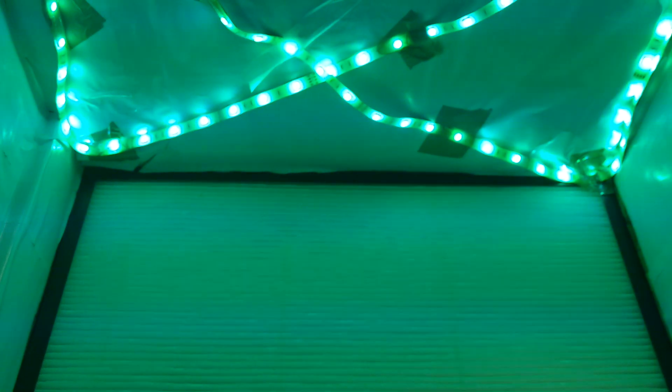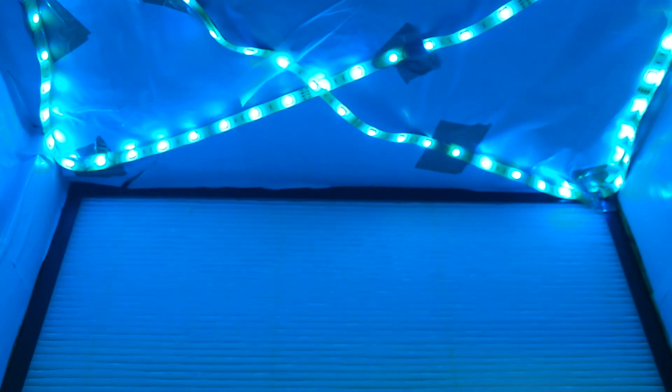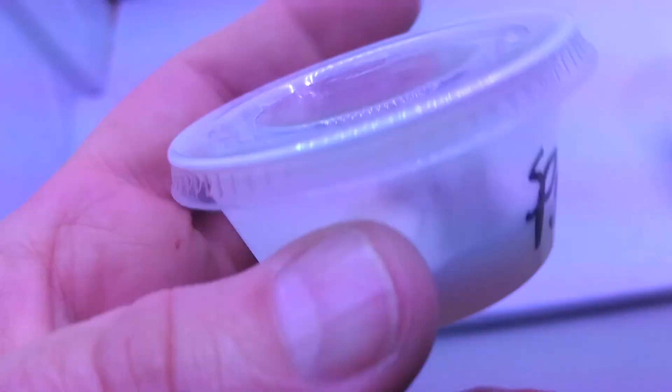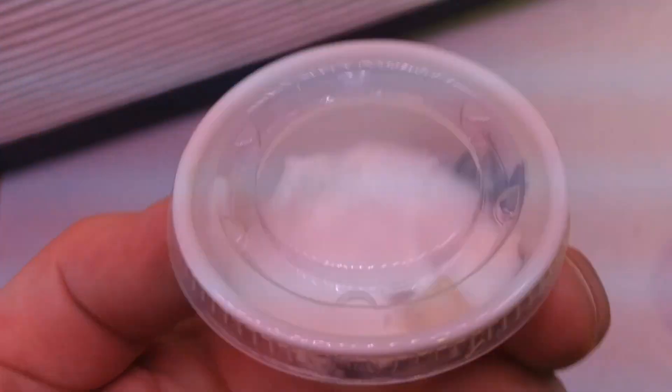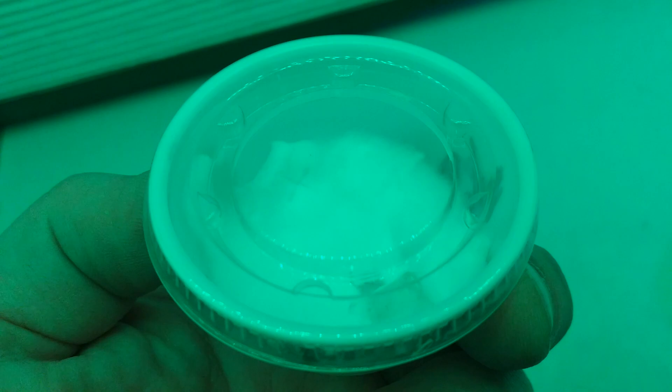When both lids are on I have this area where I can do all my flow work with no side air. I have side deflection sides up and the top to protect me from any contamination. I have LED light strip on the top as well.